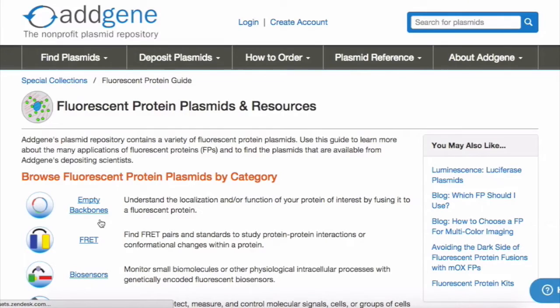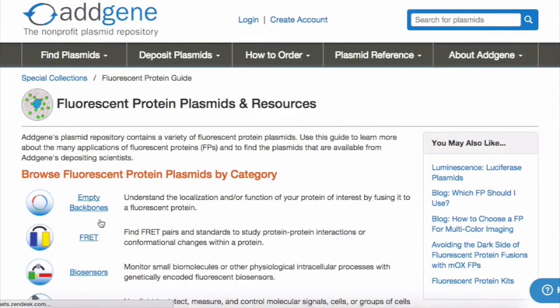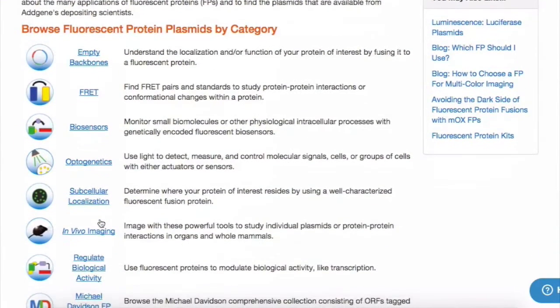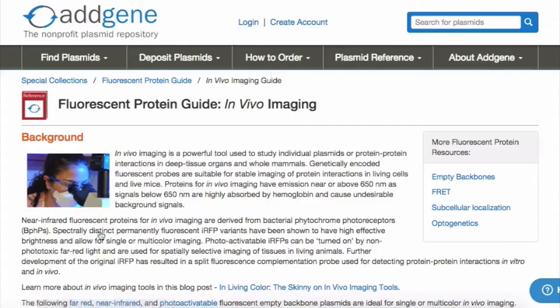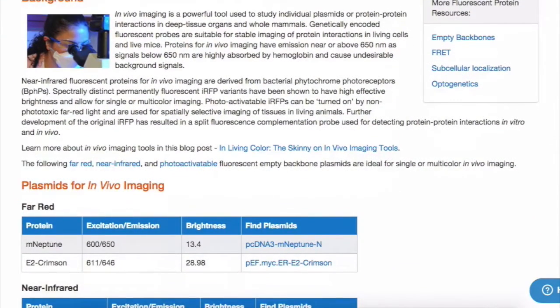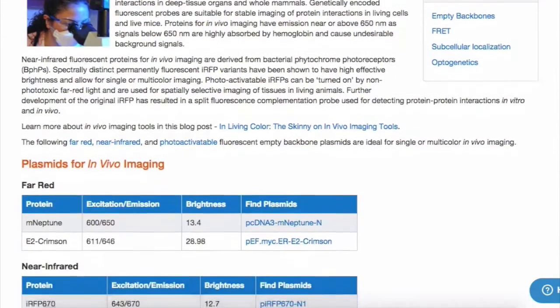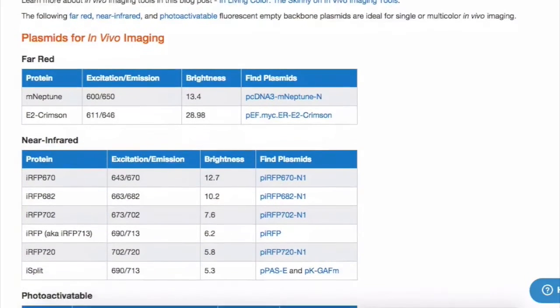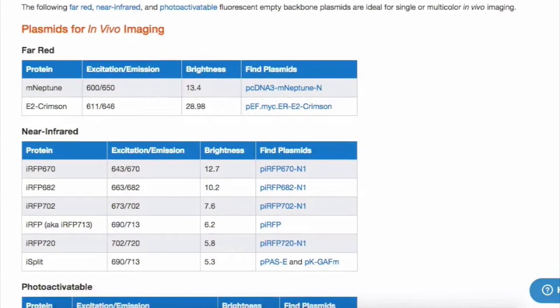If you are interested in plasmids for in vivo imaging, you can navigate to that subcategory. On this page, you can find some background information, links to relevant blog posts about in vivo imaging tools, and tables of relevant plasmids.